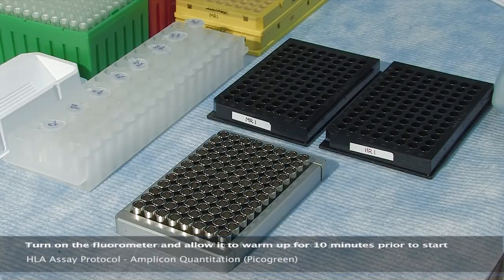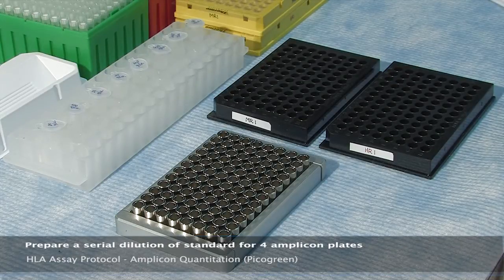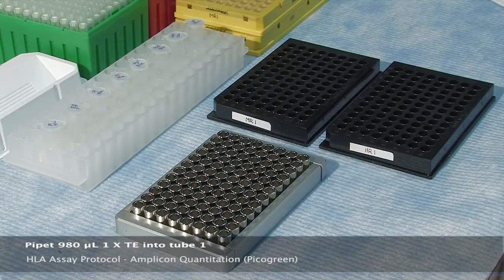Per the manual, using eight 1.7 milliliter tubes, prepare a serial dilution of standard for four amplicon plates. Note that volumes may be adjusted for any number of plates to be quantitated. Pipette 980 microliters of 1X TE into tube one and 500 microliters into tubes two through eight.